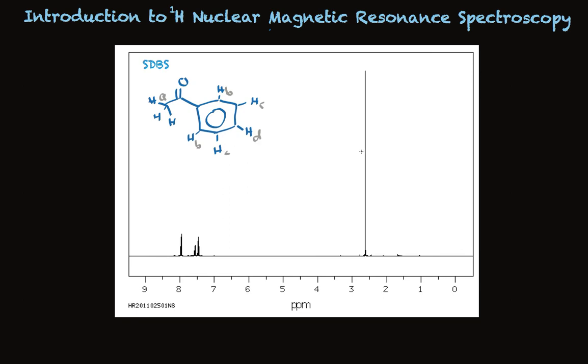These 3 hydrogens have no neighbors, so they should come as a singlet at a chemical shift that says it's probably near a carbonyl. Look at this. Perfect. Now I can tell you that the integration for this signal is 3H compared to the integration for this signal, which is 5H. In theory, you can measure this from the spectrum, but in reality, we usually ask the NMR to tell us what the ratio of these signals is.